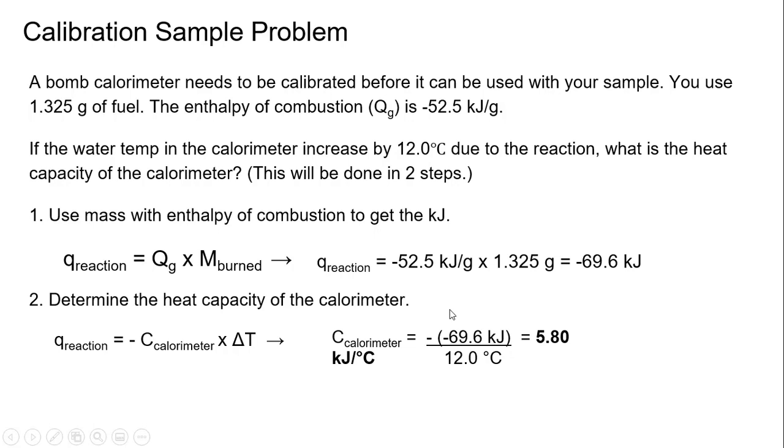You're going to take this answer, and now you're going to determine the heat capacity of the calorimeter. This is very similar to what I just showed you on the other page. Unfortunately, this moved over, and I apologize. This should be with this, and I'm not sure why it changed when I saved this, but it doesn't matter. You can see that this is from here, and it's on top. I isolated this out.